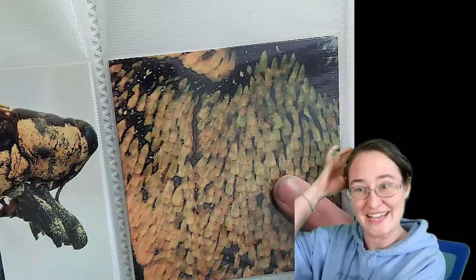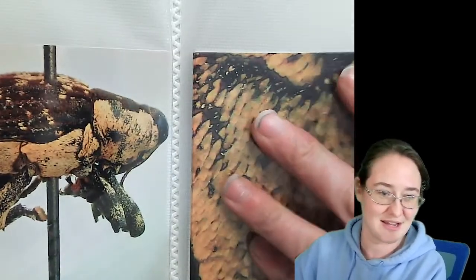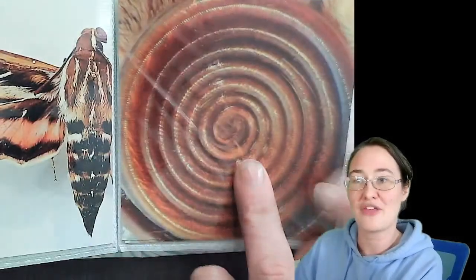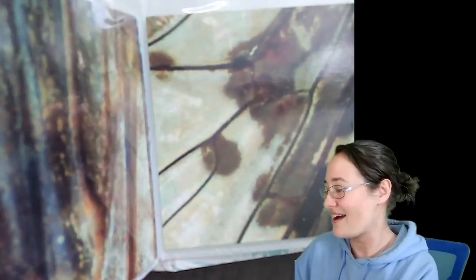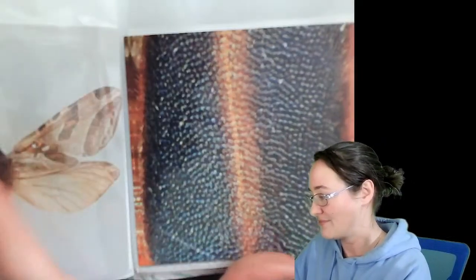Oh, the plates from the weevil we looked at today, a 4x4 print of him. And this is the weevil that those scales belong on. Look at me saying scales. And like the wing of this moth right here, the white-lined sphinx moth, and its proboscis. You can see its proboscis curled outside of its body. So this is its proboscis and its hind wing. Really cool wing venation. And different images.